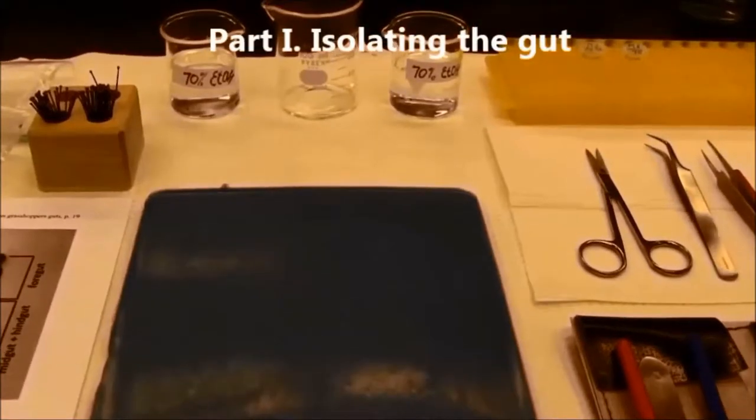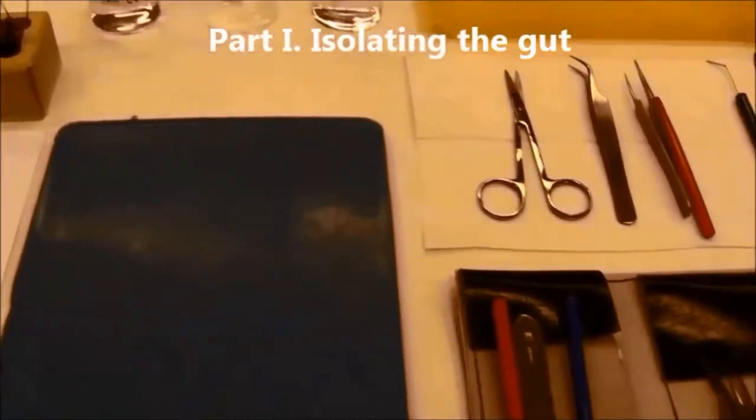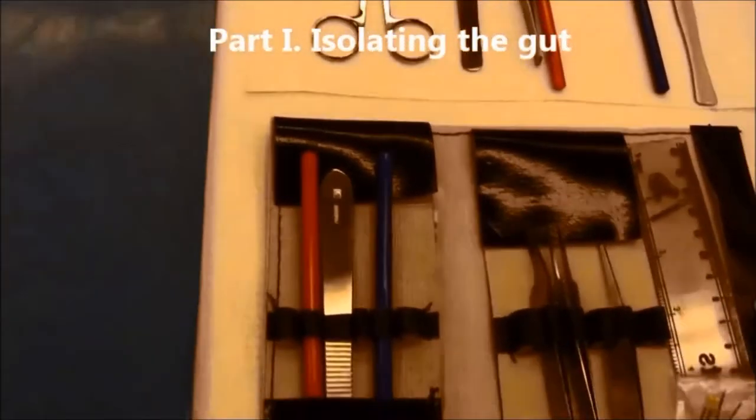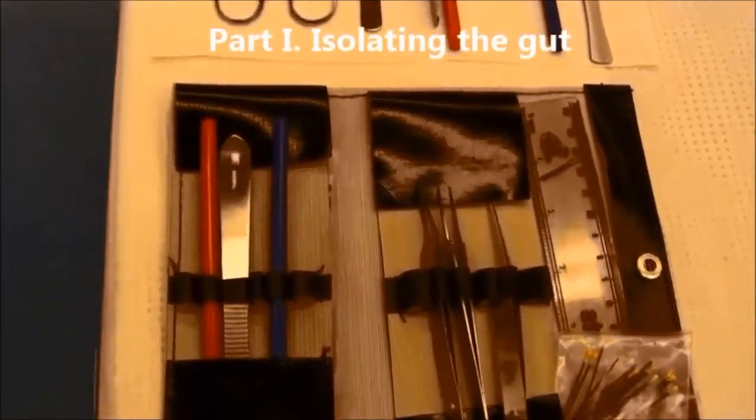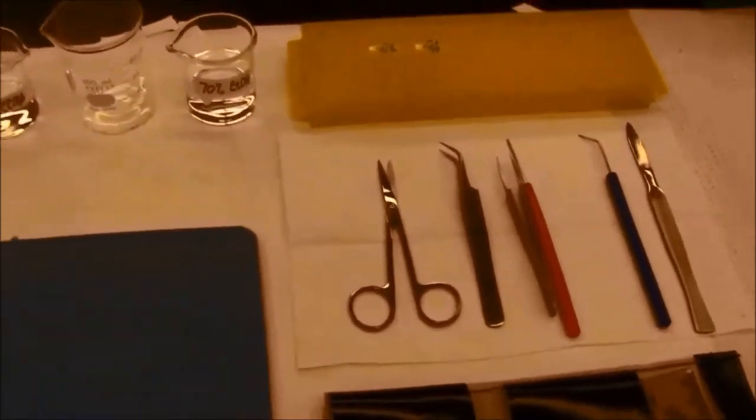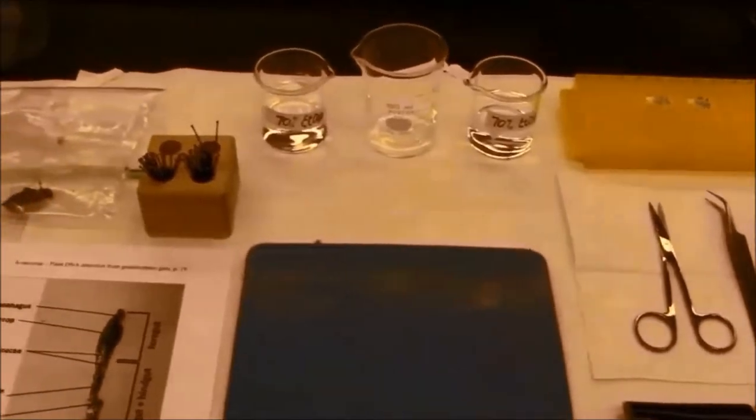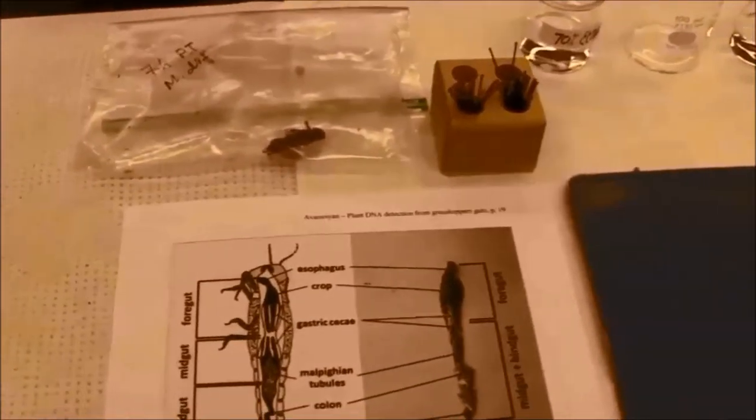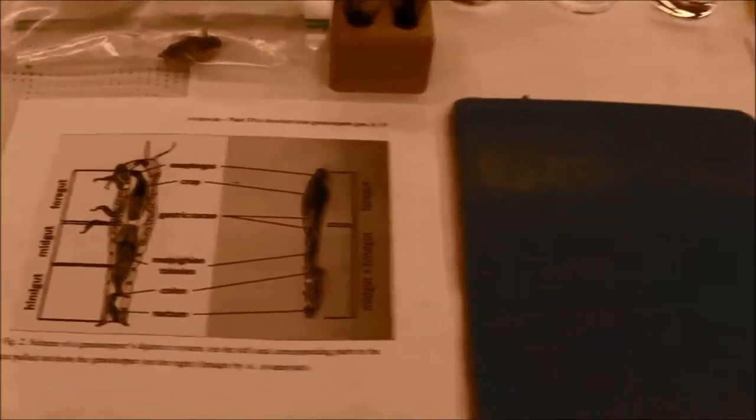To dissect a grasshopper, I will need a small dissecting pad, a standard dissecting set which includes scissors, forceps, and a scalpel, microcentrifuge tubes, ethanol, insect pins, and a scheme of a grasshopper's internal structure.